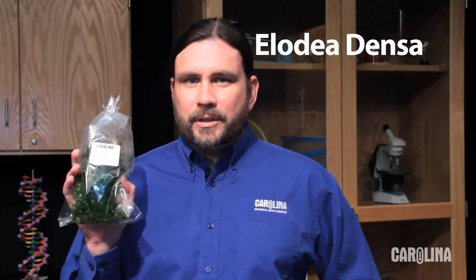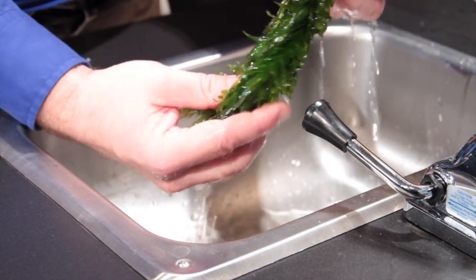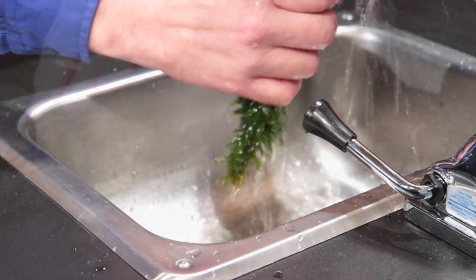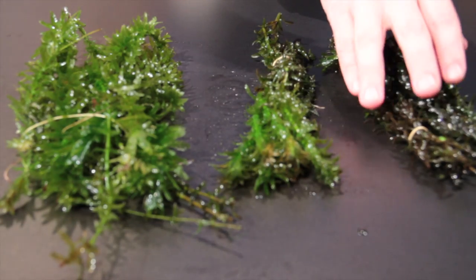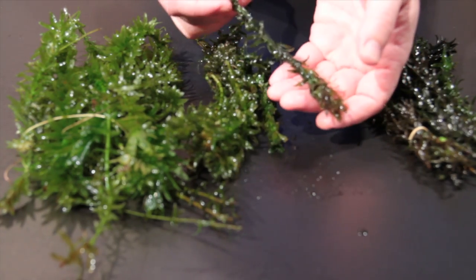Elodea is our most popular plant. It's used in studies for photosynthesis and to view cytoplasmic streaming. It arrives in a sealed plastic bag. Rinse the plants in running tap water and give them a visual inspection. Healthy plants are dark in color or bright green. They should be good sturdy plants. Discard any that are mushy.